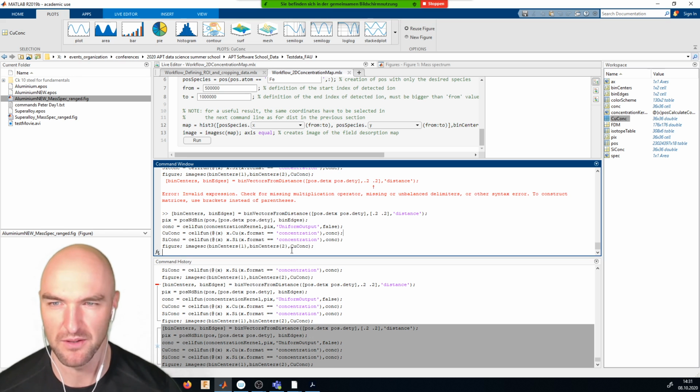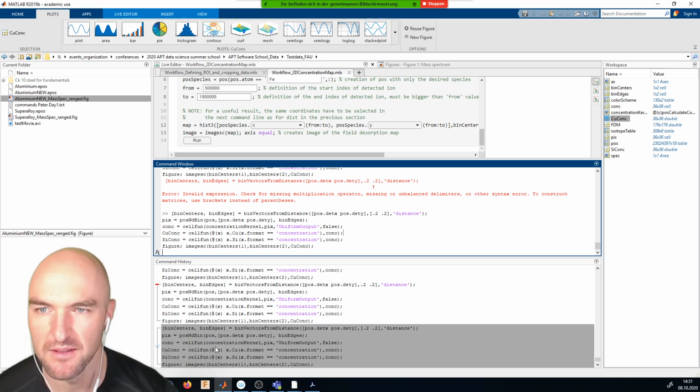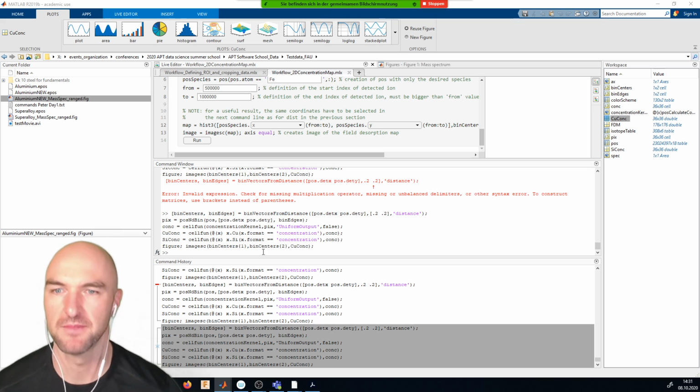Why does it take so long? It was much faster before, just right now. Oh yeah, there we go.